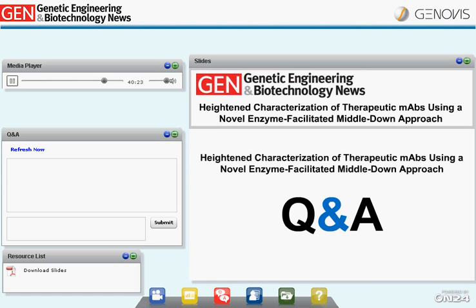Thanks, Tamlin. Okay, so the next question, Rob, for you is, for sequence variant analysis for clone selection, what is the quantitation limit using the subunit domain mapping assay? Using the assay that we showed, the preliminary sensitivity is below 1%. However, we have not formally established this as the LOQ. That's something that we will be working towards. At the moment, it's right around 1% or lower.